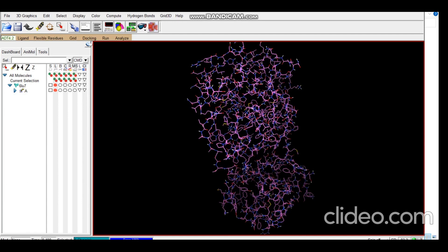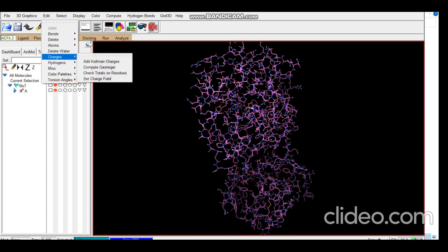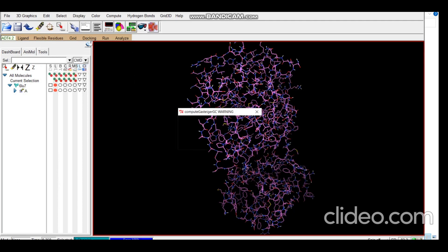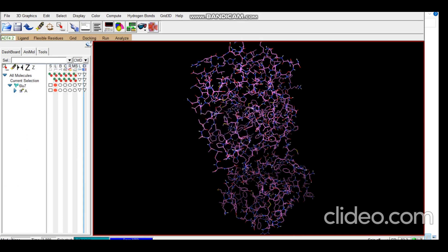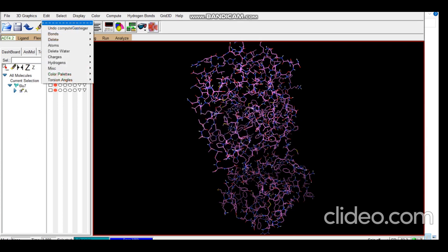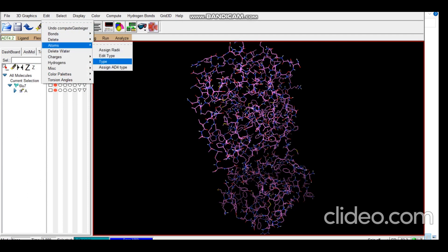Next we will compute charges. We will be computing Gasteiger charges, and the last thing is atom type. We'll be assigning AD4 type, that is AutoDock 4 type.